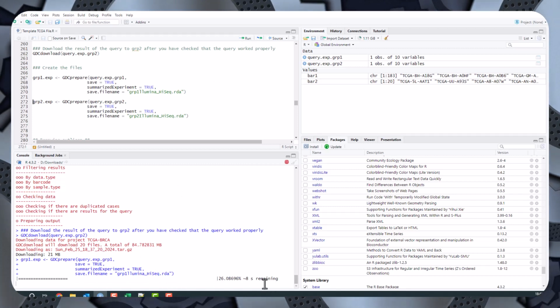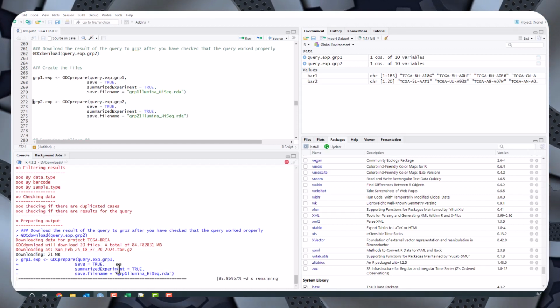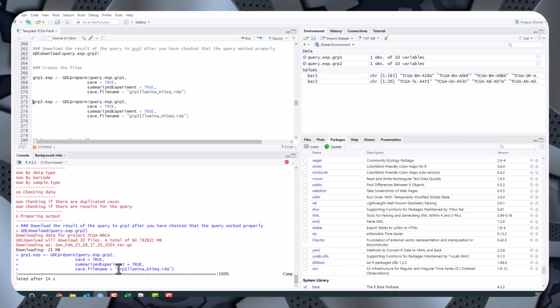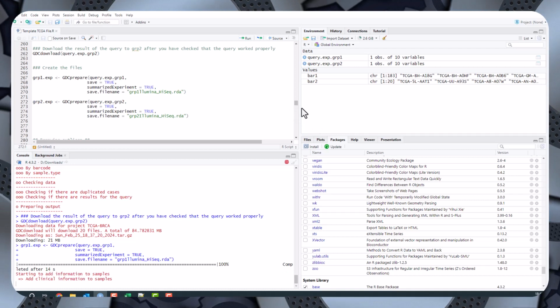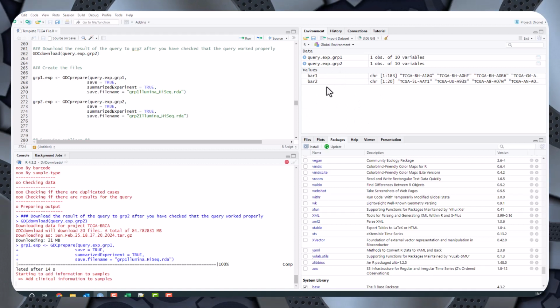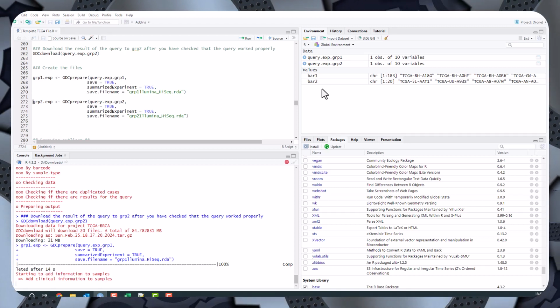What it does is it takes all of the different files, brings them all together and imports them inside R. So when it's finished, you'll see a new thing appear inside R, which will be a very big set of data, because this is a big matrix. You have one row for each of your patients, and a column for each one of the genes.